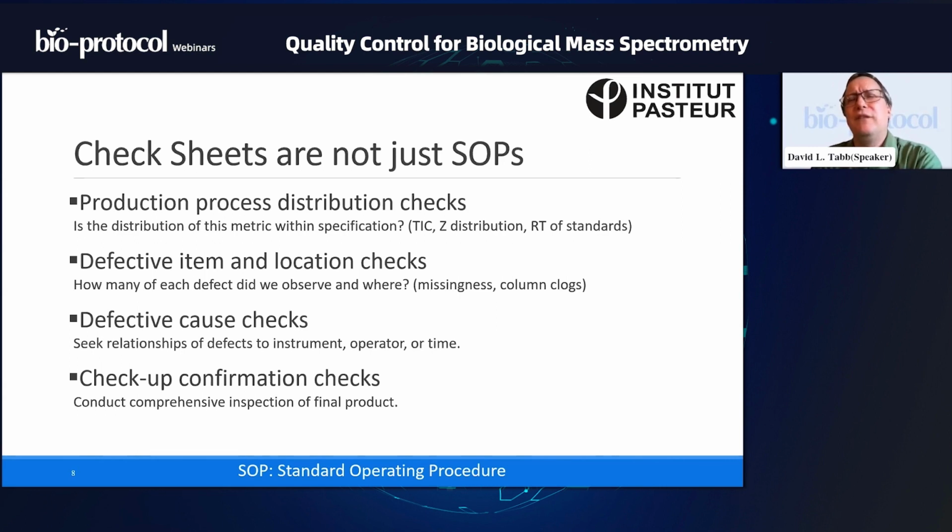How would you feel if you sent 15 samples to the core facility and they represented 3 cohorts of 5 samples each, and the lab used exactly the same set of procedures for the first 10 samples, and then changed to a very different set of protocols for the last 5 samples? You'd be pretty mad, wouldn't you?